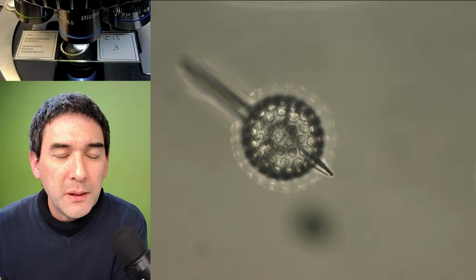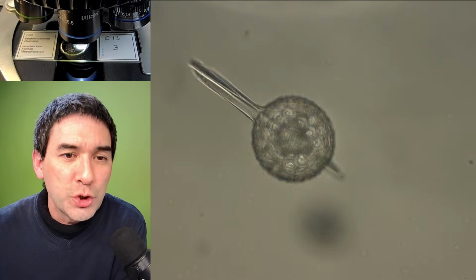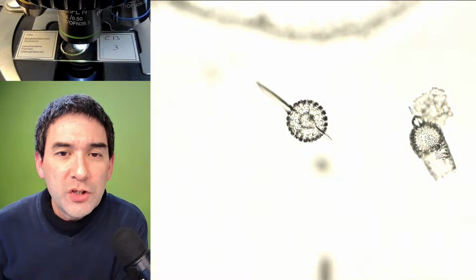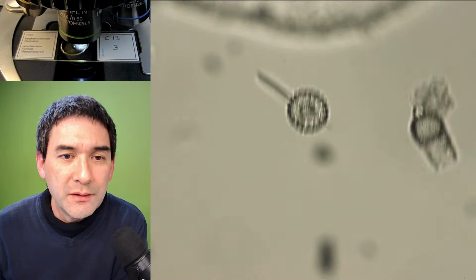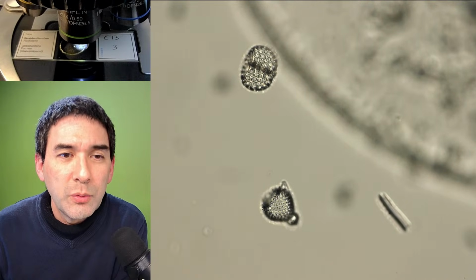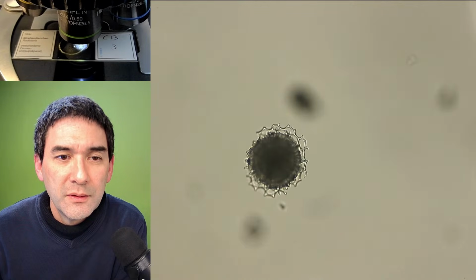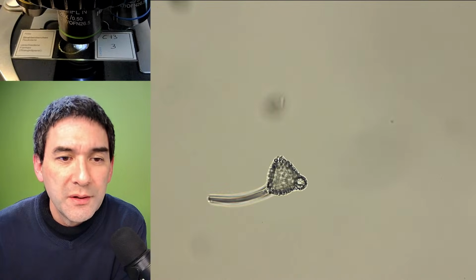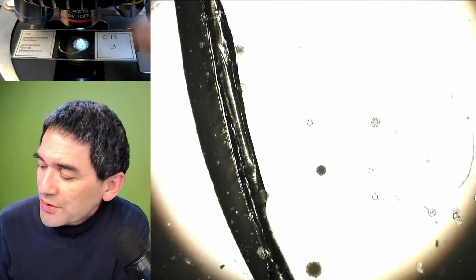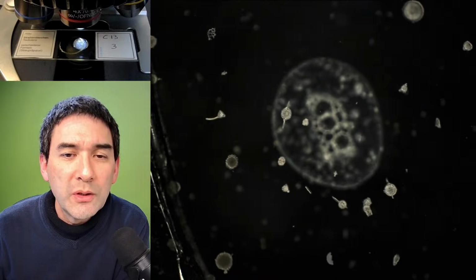But these are basically also single-celled microorganisms, and that's their shell that they have. Yeah. So those are essentially from water, and they can be found in sand. Yeah, and in certain regions of the world, they're quite common on beaches. So there are a whole bunch of different shapes, and they might be a little bit small, but they're quite nice to be seen over here, right, in dark field. Yeah, you can see them quite well.